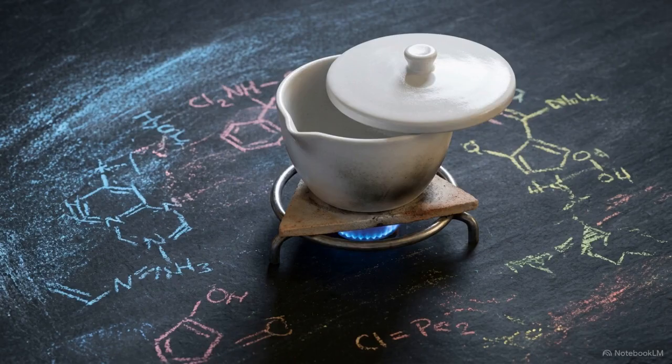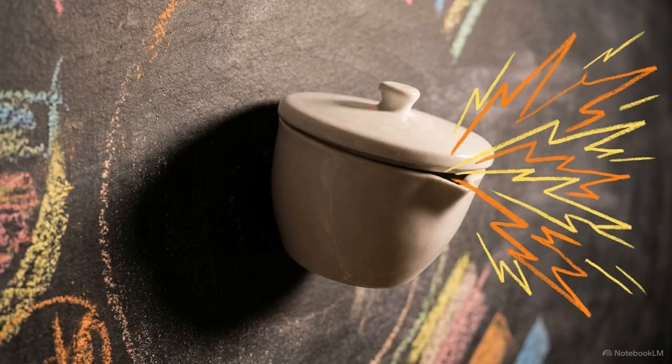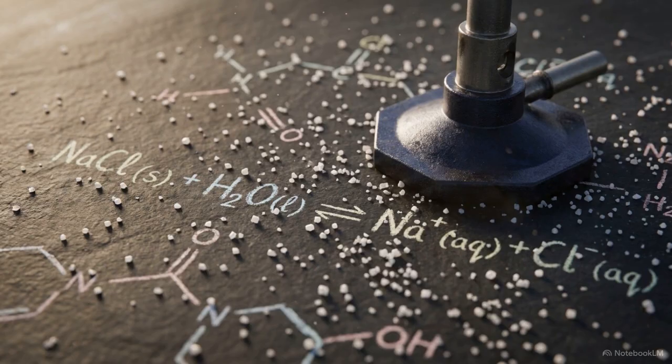Now we move to the evaporation phase. Place the crucible back over moderate heat, with the cover left slightly ajar. This will slowly drive off the water and the excess hydrochloric acid. Listen closely. Any popping sound means the liquid is boiling too vigorously. That popping causes spattering, which results in irreversible product loss and a ruined experiment.